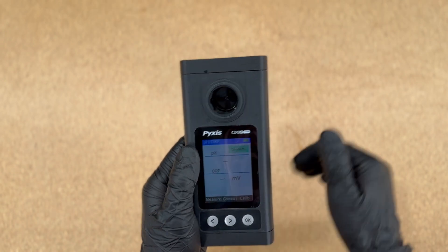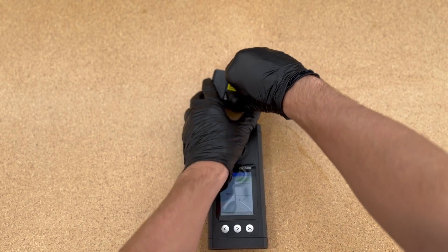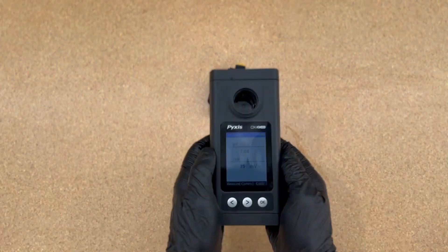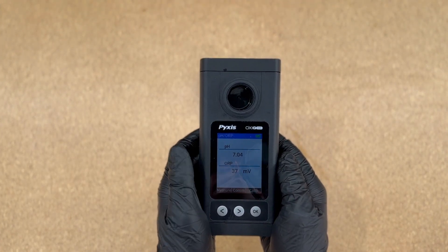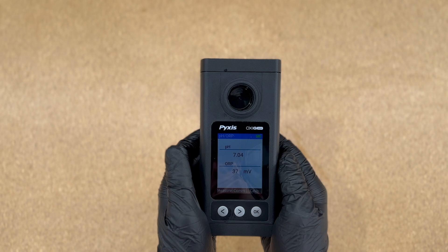You can use the Connect button to go ahead and connect to your Bluetooth pH ORP module — and remember to open the lid so that the module is on. Once it's on, you'll see on the OxyGo the actual reading of pH and ORP.